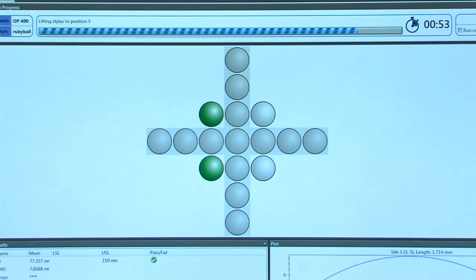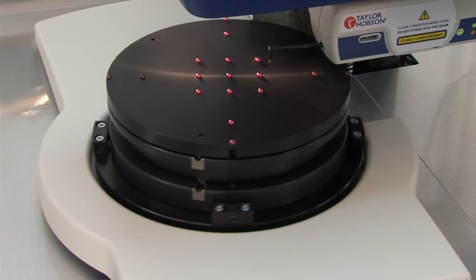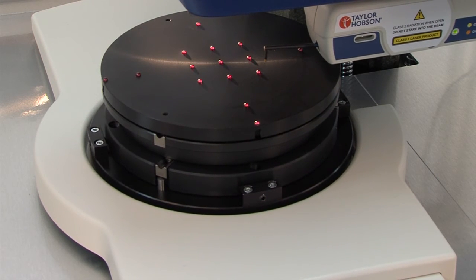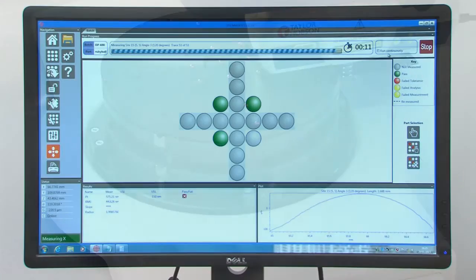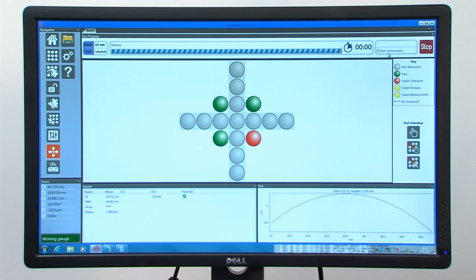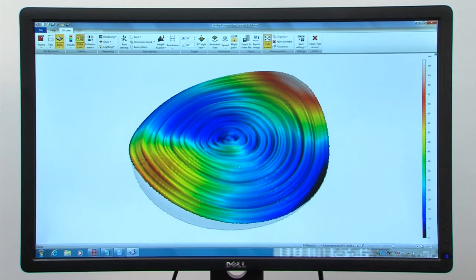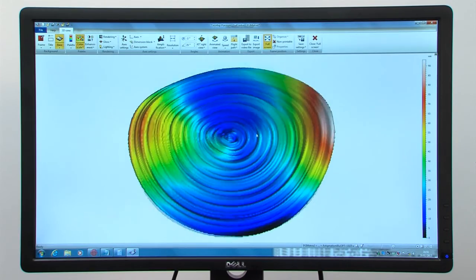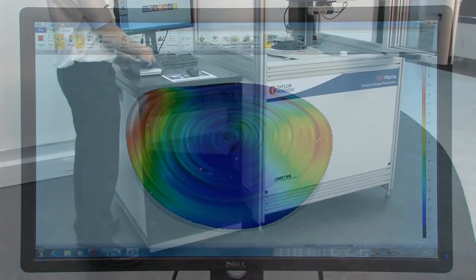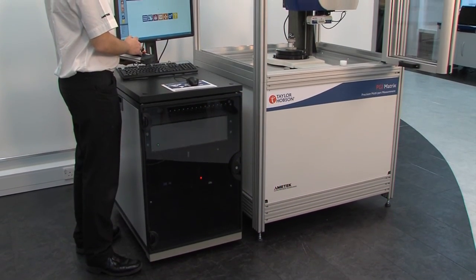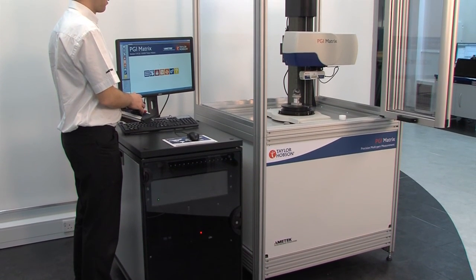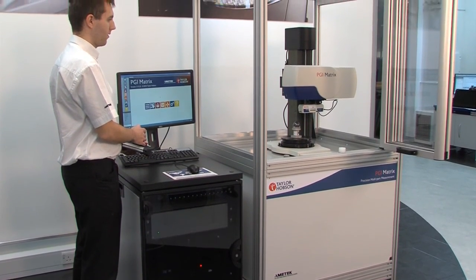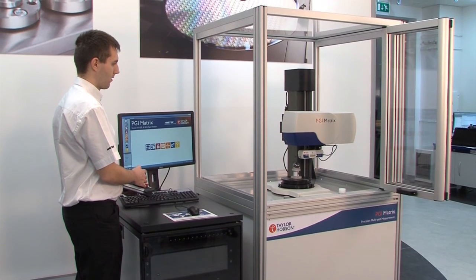The TallySurf PGI Matrix is a fully automated one-touch optics measurement system. It will increase your productivity with an easy to use interface and Tallymap analysis software. It's equally at home with single or multiple parts, is fast and accurate. The PGI Matrix, from Taylor Hobson.